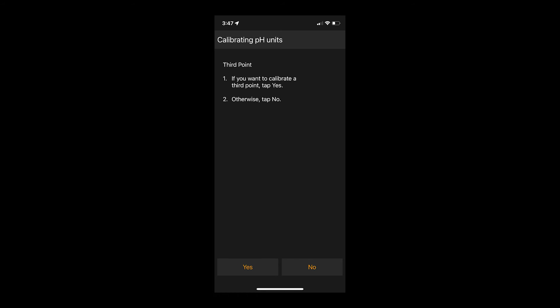You will then be prompted to calibrate a third point. We actually don't recommend that you do that unless otherwise required by your SOP. To bypass a third calibration point, click Done. At this point, you will see your sensor response factor shown on the screen. That concludes our pH calibration video today.